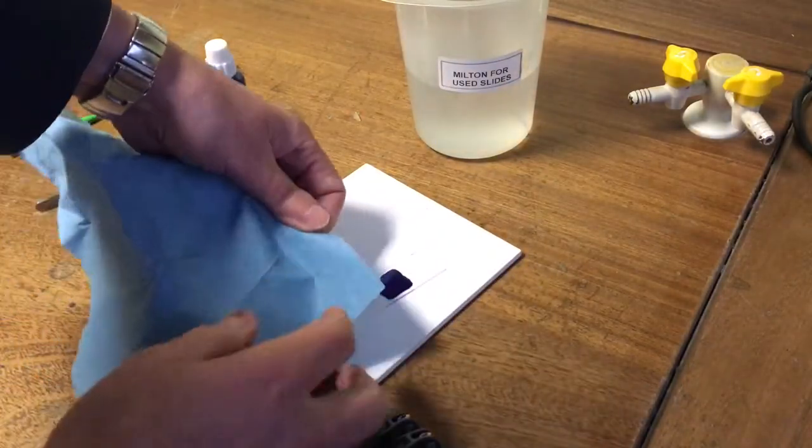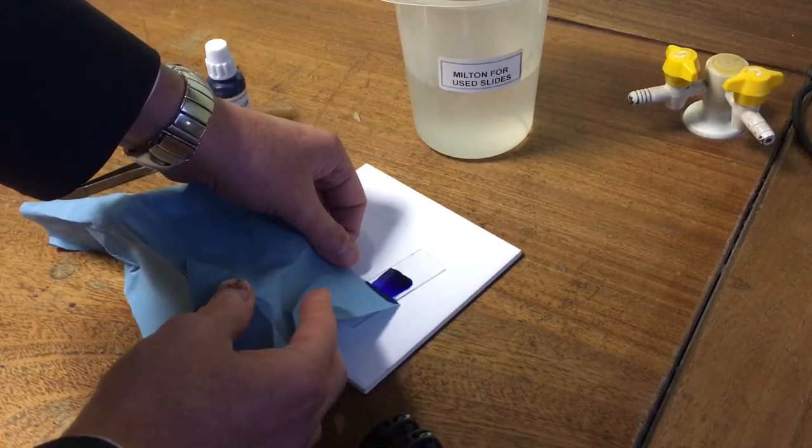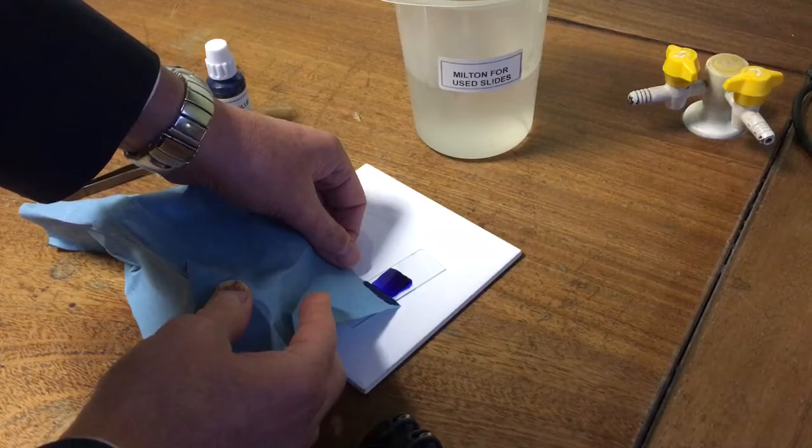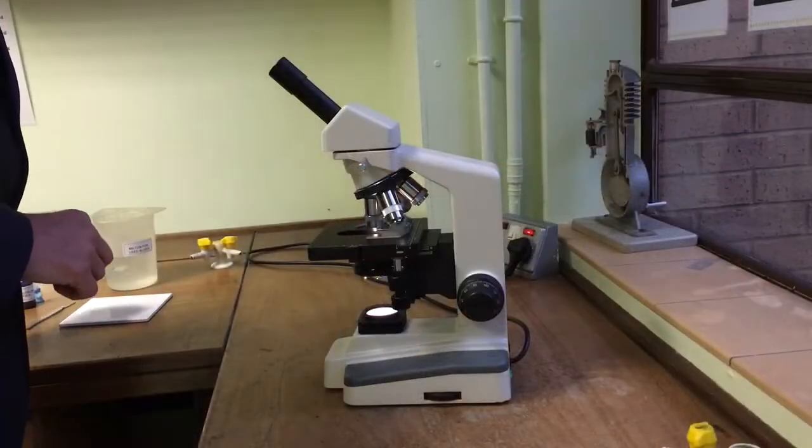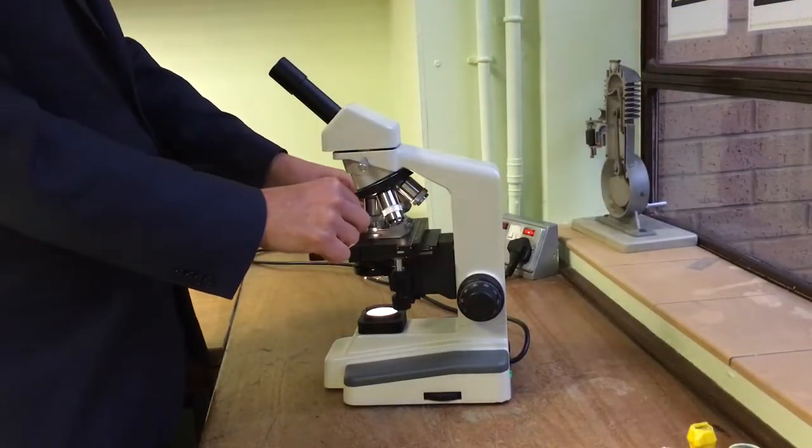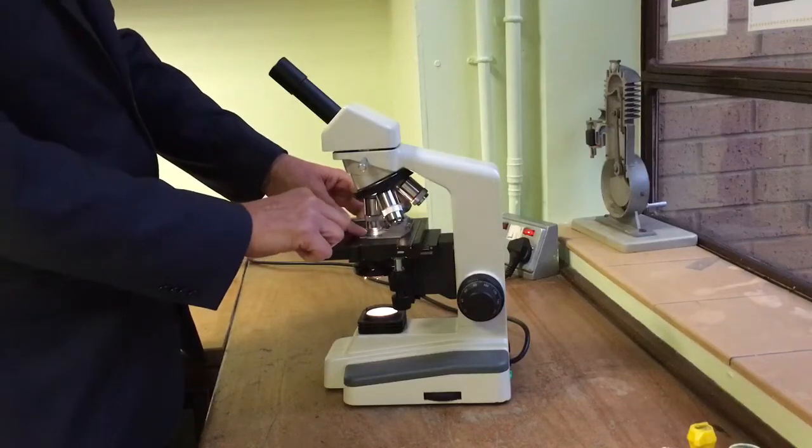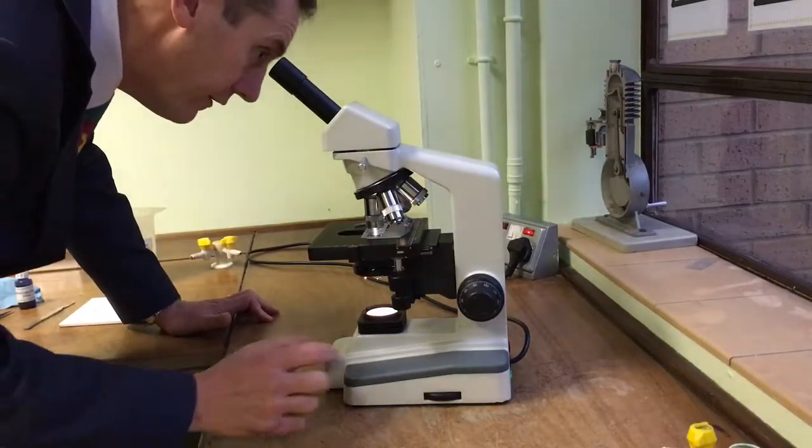And it will make the slide very dark under the microscope. So I'm going to use a paper towel to just absorb the excess stain. I've removed the excess stain from this slide, and now I'm going to place it onto the microscope stage. Like so. And now it's ready to view.